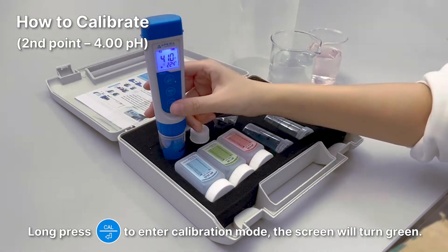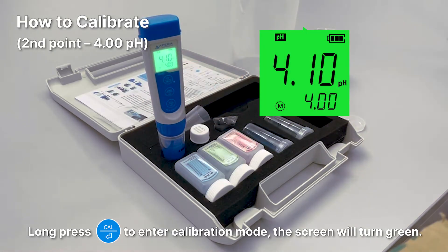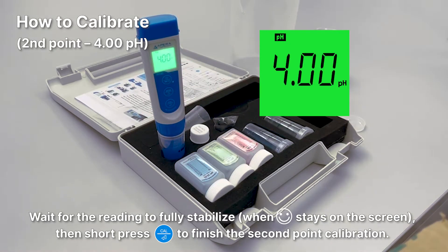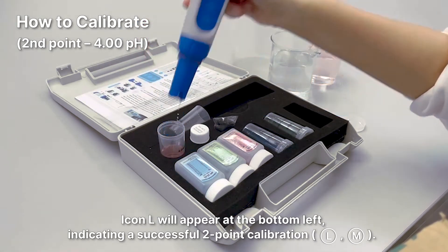Long press the CAL button to enter calibration mode — the screen will turn green. Wait for the reading to fully stabilize, then short press the CAL button to finish the second point calibration. Icon L will appear at the bottom left, indicating a successful two-point calibration.